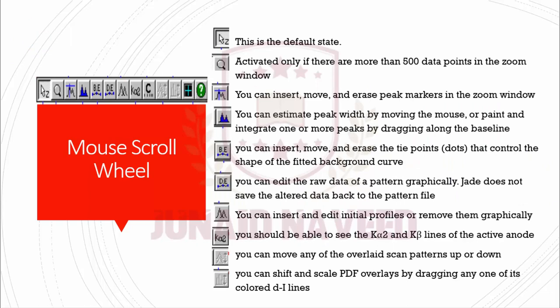This is the Long Crosshair on/off button. What are the functions of these buttons? The first is the default state. The second option is basically activated only if there are more than 500 data points in the zoom window. With this button you can insert, move, and erase peak markers.